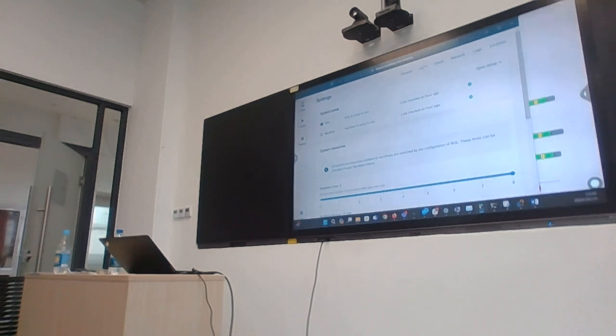Yeah, so I'm just doing these instructions. These are root steps. You must keep track of this page. And then this.